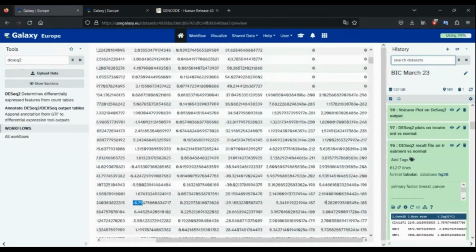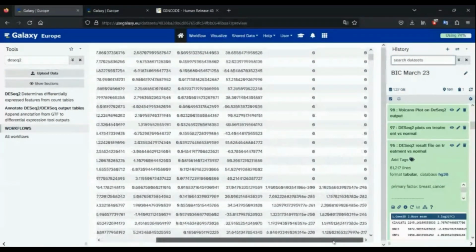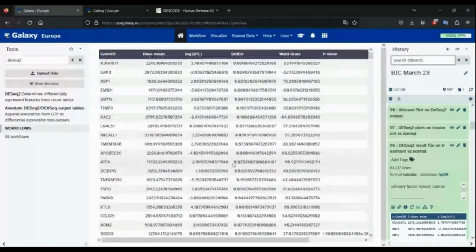If you check their p-values, sorry, the FDR again, you can see that the numbers are quite small. So obviously we can say with confidence that these genes are expressed and these are not false positives. These are actually expressed. So that's what the table tells you. And this is the output that you will be using for most of your analysis.